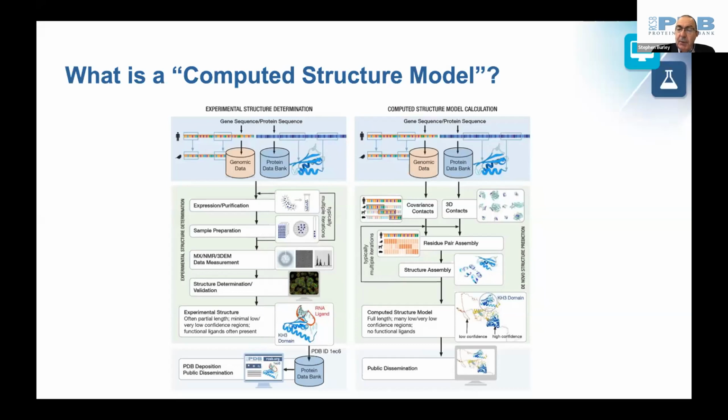The beads or the meatballs being the well-defined globular domains, such as this KH domain, which corresponds to this part of the PDB structure on the left-hand side, and then two other KH domains, all three of which were predicted by AlphaFold 2 at high confidence, but about 70% of the polypeptide chain could not be predicted with high confidence, and it's probably intrinsically disordered in the absence of other protein partners, and is not actually amenable to study by X-ray crystallography methods.